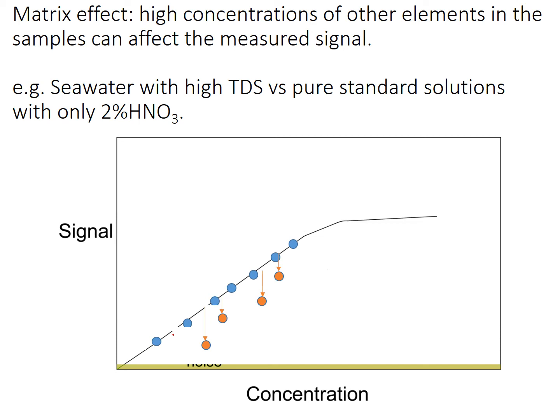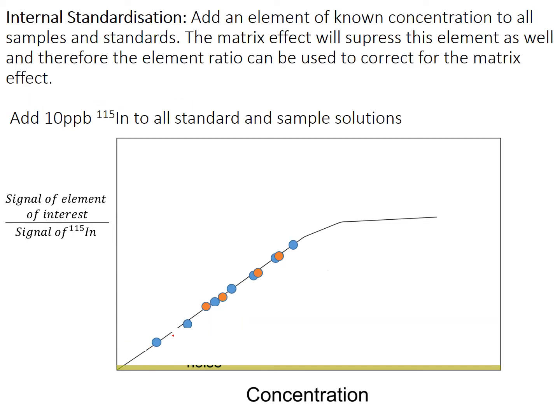Okay, so that means that if we tried to measure something and we got an intensity like that, its concentration would appear to be much lower. Okay, so this is a problem. Okay, so I drew some lines on there. Look at that crazy animation.